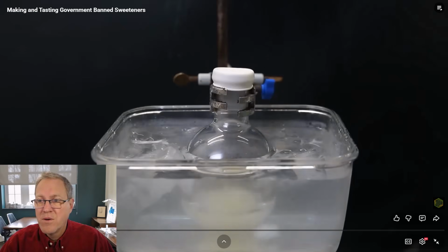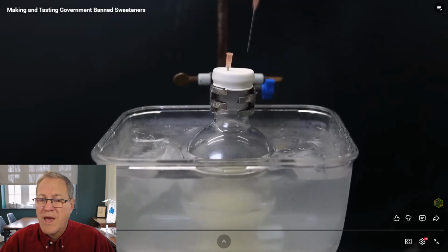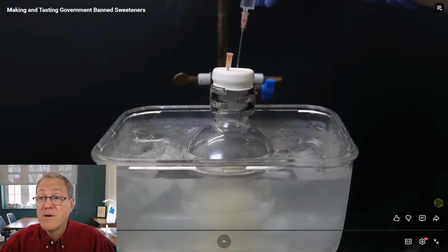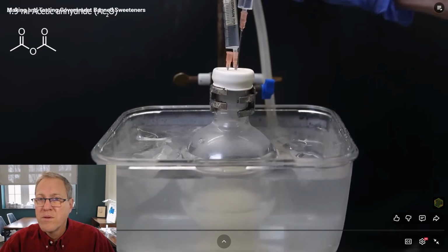I then replace the funnel with a septum to perform the reaction under nitrogen, like is done in literature, but I'm not convinced that it's strictly necessary. Yeah, I agree. This particular reaction should not be sensitive to air in any way, but it's not going to hurt anything. It's just a precaution. I add 1 needle as an exit, and then a needle attached to a syringe with a nitrogen line. So if he has nitrogen pressure in that syringe coming through that hose line, it will vent out that other needle hole and it will slowly purge all the air out, and he'll just have a nice inert atmosphere of nitrogen in his reaction.